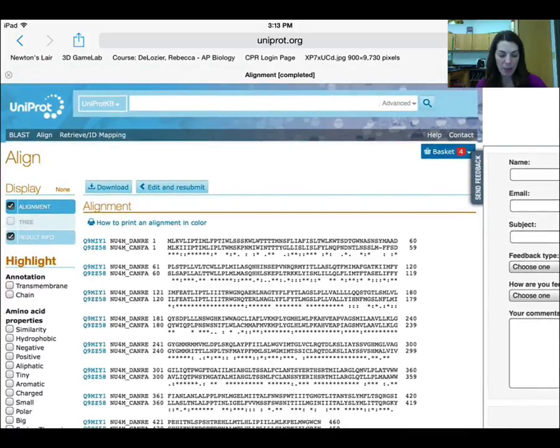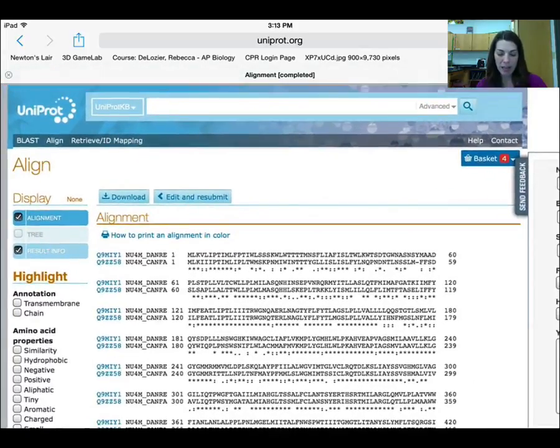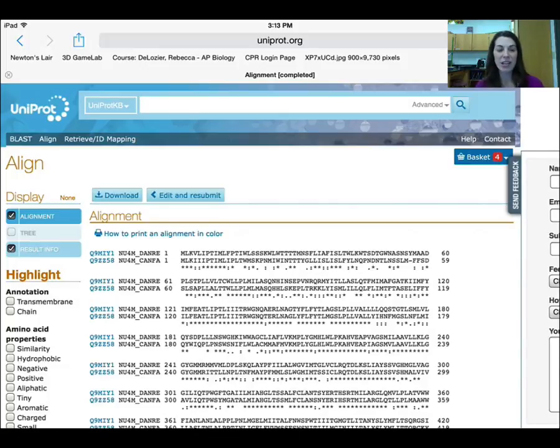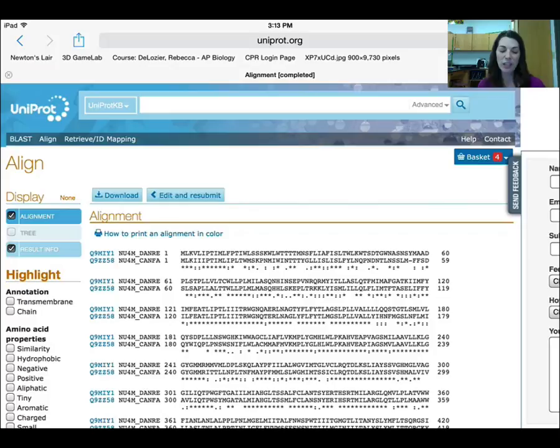Hopefully that helps you navigate the website. If you play around with it a little bit, you'll be okay. Just remember to use the basket, remember to use your check boxes for display, and remember to look at the gene abbreviation — not just the name — because there are a whole bunch of different hemoglobins. You're looking specifically for HBB.